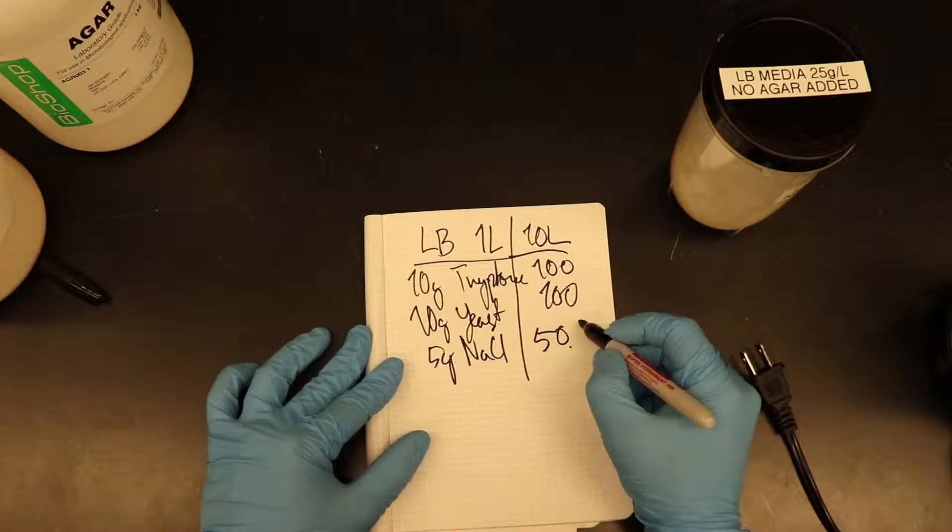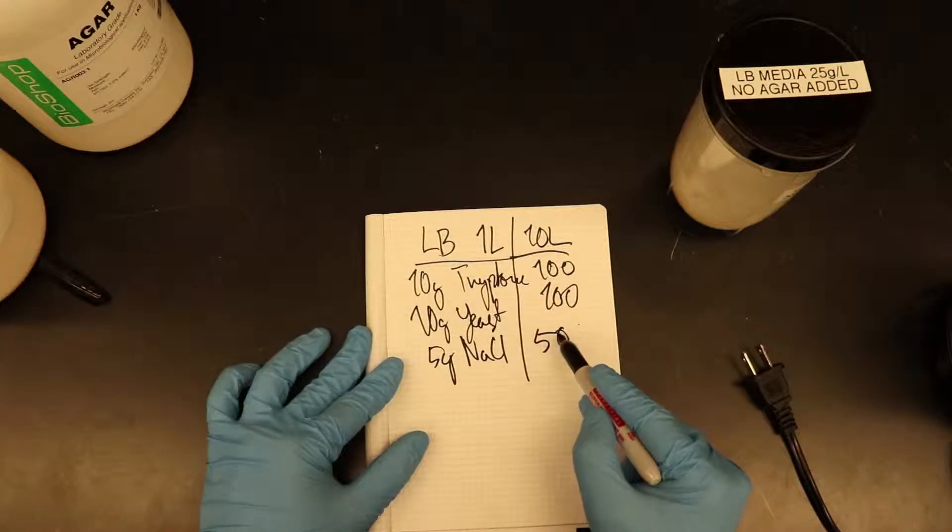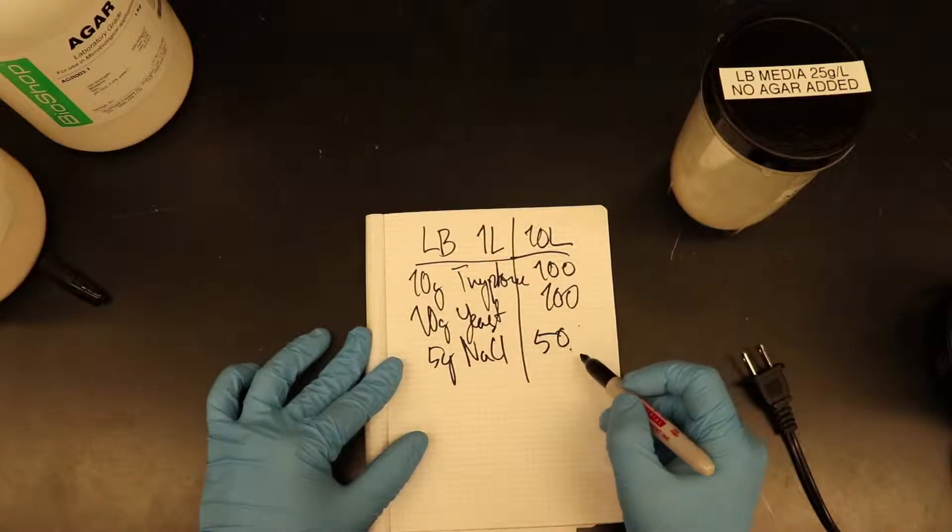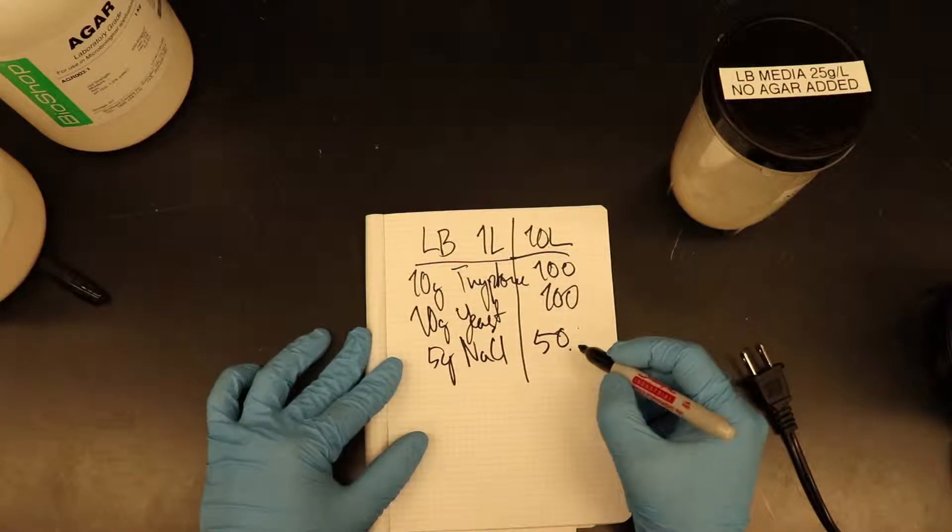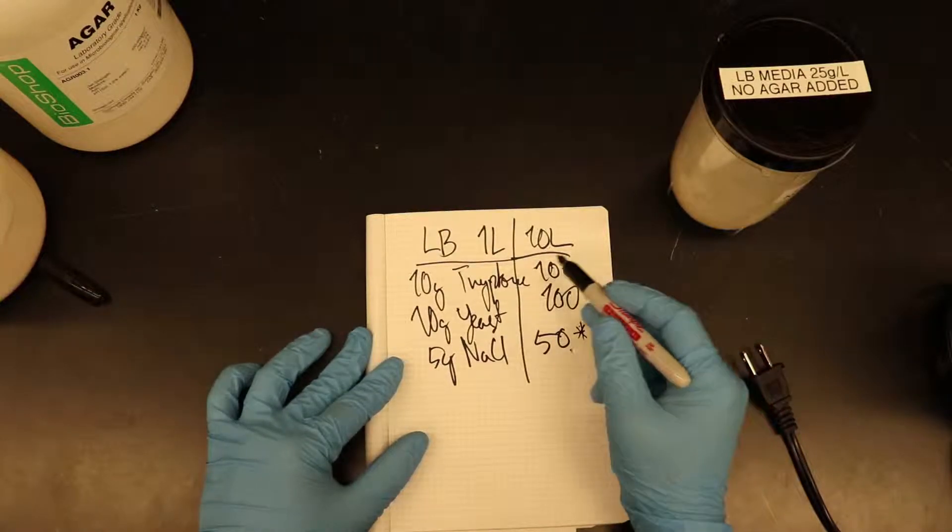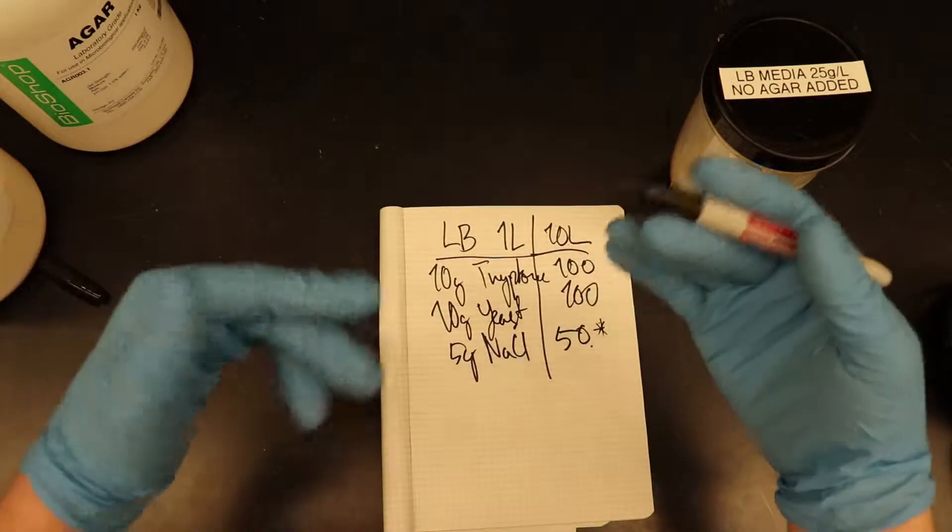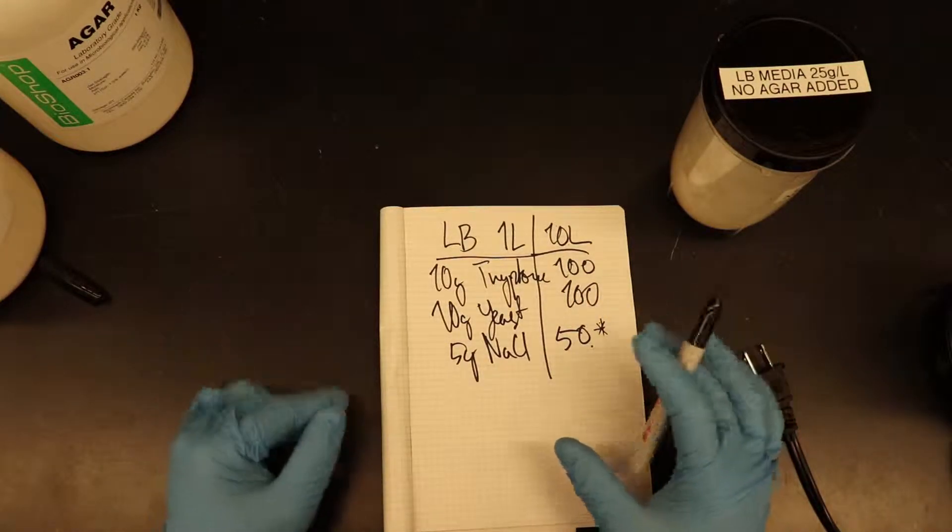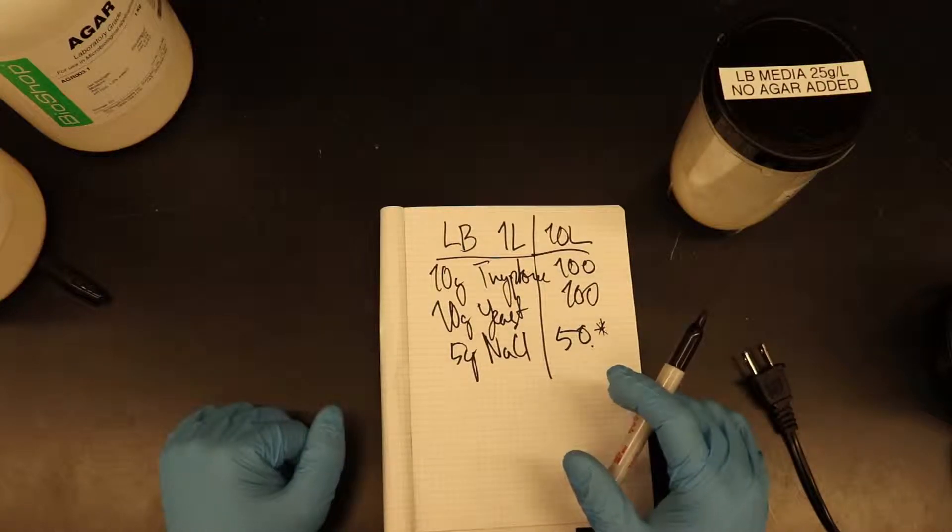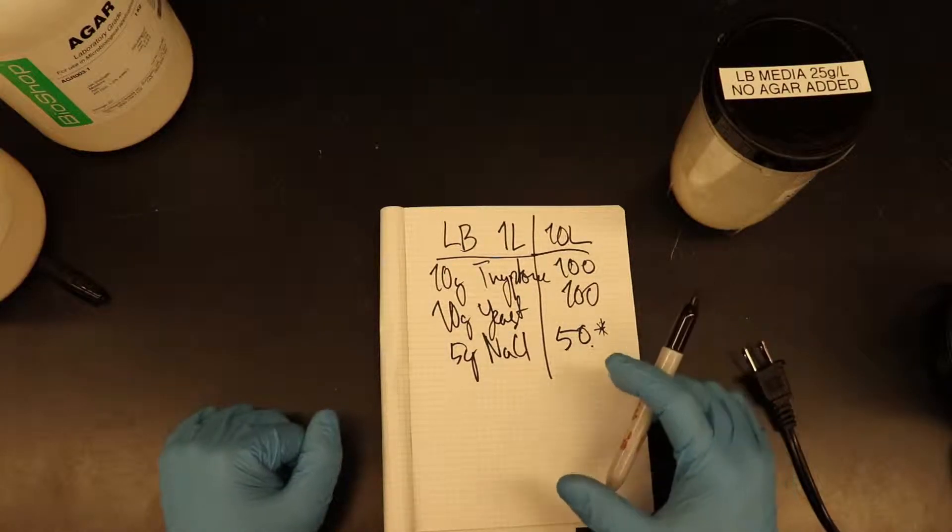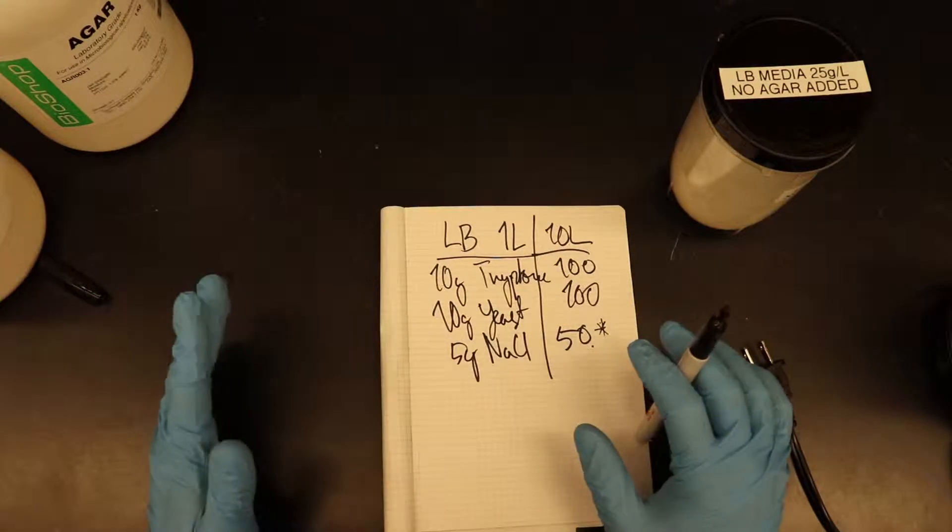And we're just going to multiply that by 10 and we'll have 100 grams, 100 grams, and of course 50 grams. So the caveat here is that you want to grind your most granular substance first, in which case here is the salt. So we'll go ahead and grind the salt first, and then after that it's actually going to be more of a mixing operation inside the blender to blend everything together. And then after we're done mixing it, we're going to make some quick, dirty, and highly effective microwave plates. So let's go!